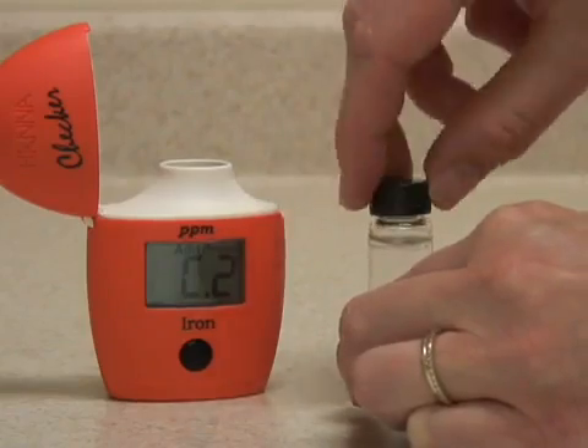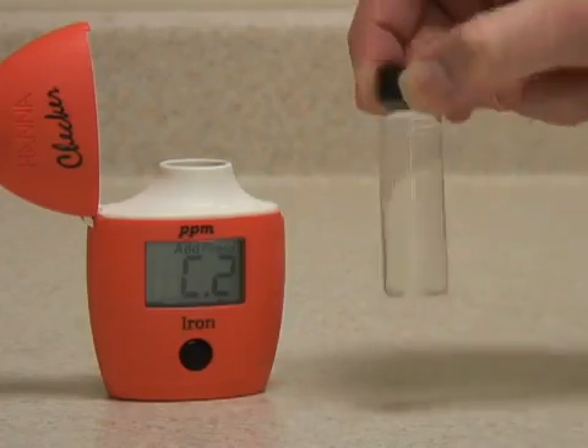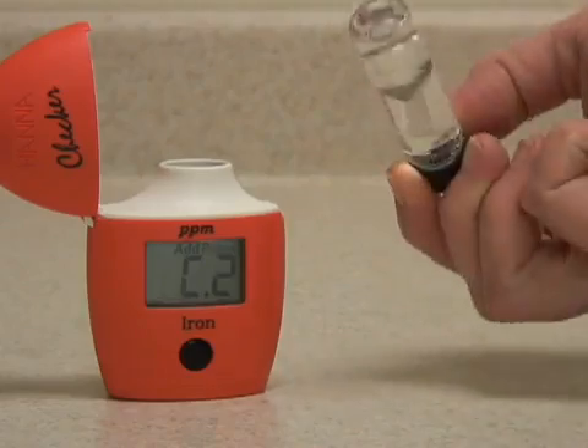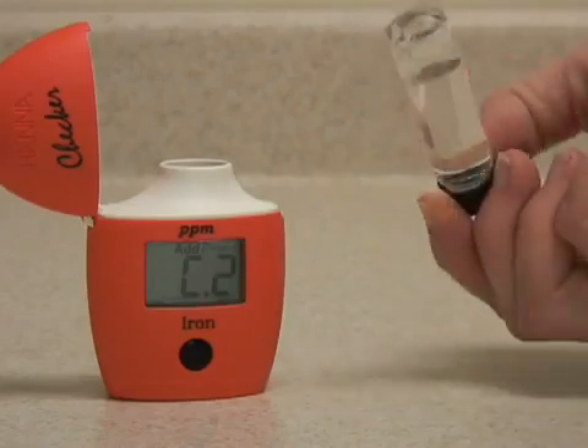Replace the cap and mix the sample with the reagent by gently swirling and inverting the vial. Try not to mix the vial too vigorously, as this will introduce microbubbles into the sample, which can throw off the reading.